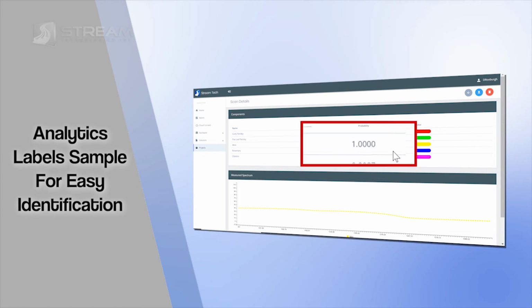And we can look here and see mint. It has decided it's mint with pretty much 100% probability, so that's a pretty good identification there. It labels the graph with the color, which is mint, and also a label saying that the scan is a mint.